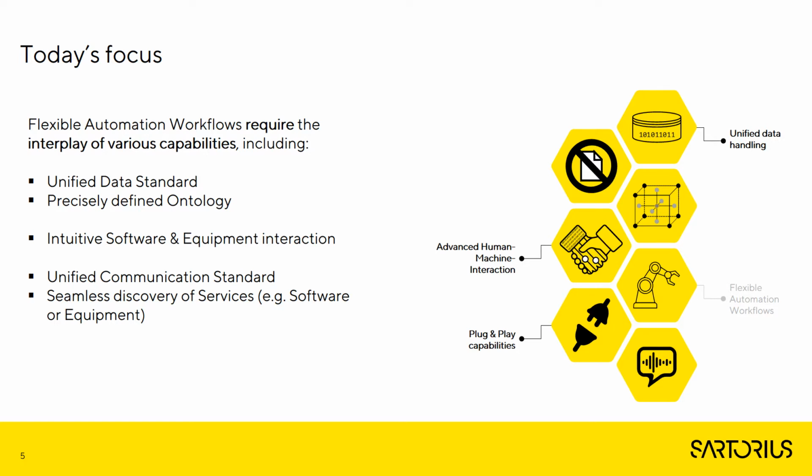In this presentation, the focus is on the underlying technologies which lead to the flexible automation of workflows. These technologies include unified data handling by relying on unified data standards and precisely defined ontologies and vocabulary, and advanced human-machine interaction, which can be reached by introducing simplification elements that provide an intuitive interaction, and finally, plug-and-play capabilities, which include a unified communication standard with seamless discovery of services.